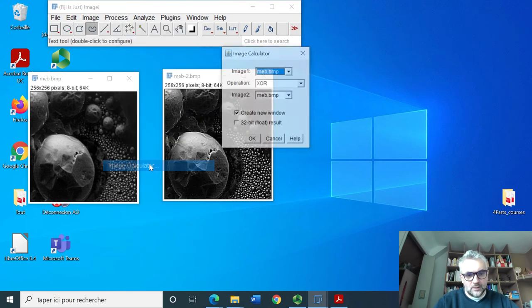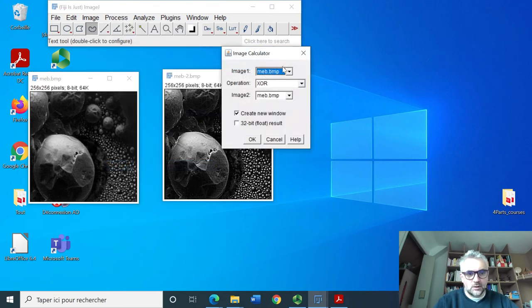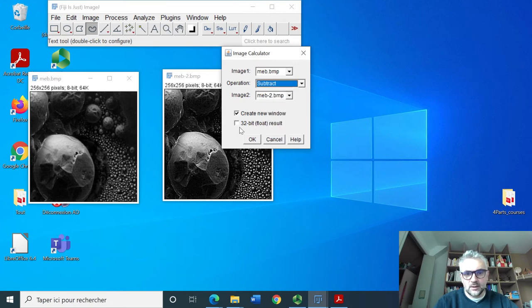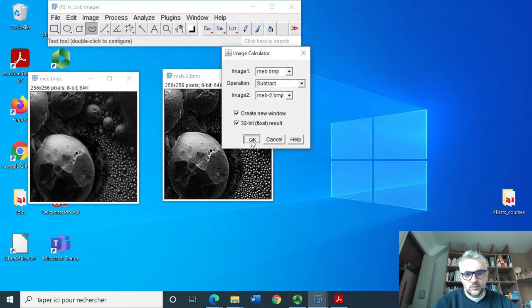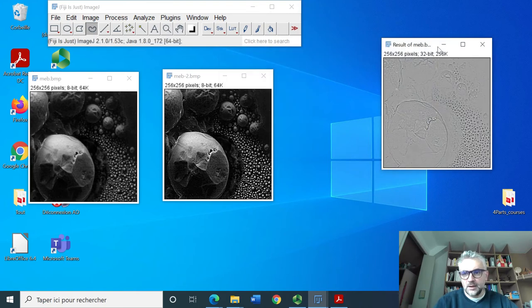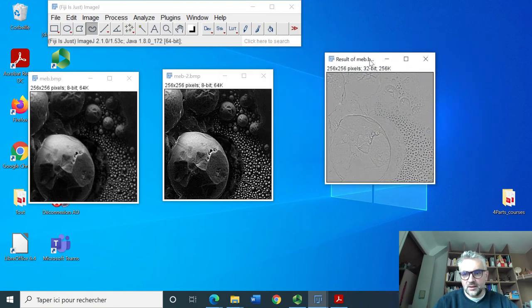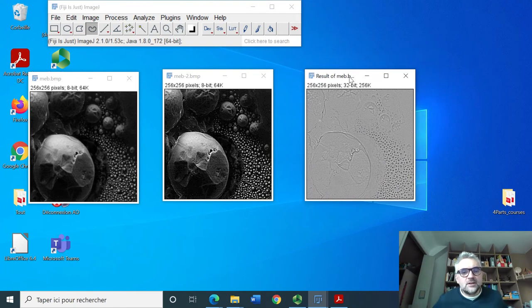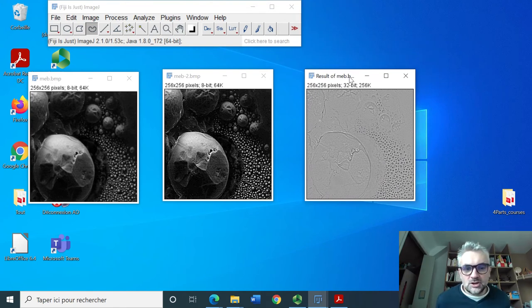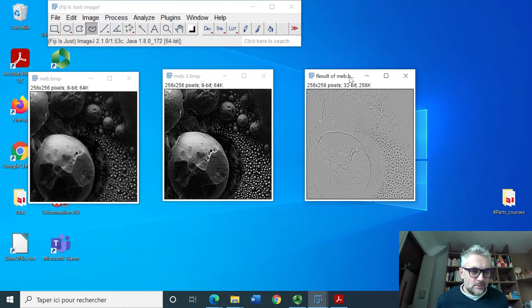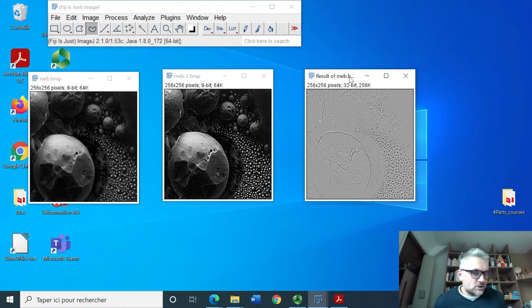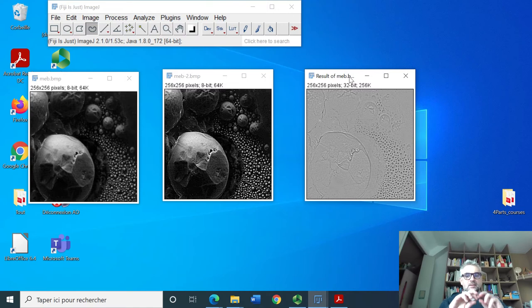We're going to take image and image 2 and make a difference, subtract here, and we create a 32 bits image. We see here the difference. Clearly the difference between the sharpened image and the original image are located at the border of the image. This is clearly where there is a difference.